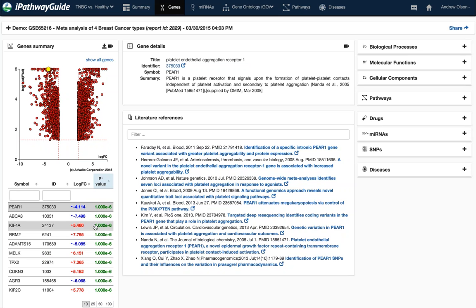Yes, I think so. Another question is about the methodology. Does the pathway analysis take into account the direction of the gene, whether it's up or down regulated, for consistency on the enrichment of the pathways? Yes, that's a big, bold yes.